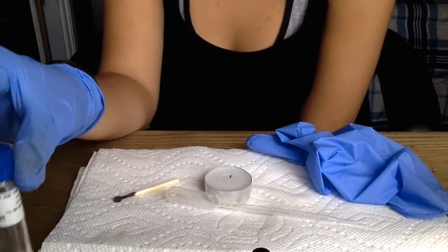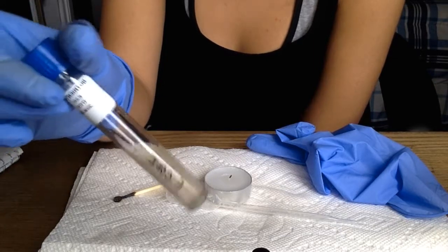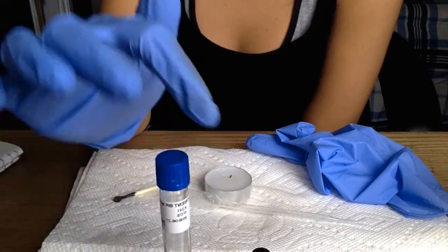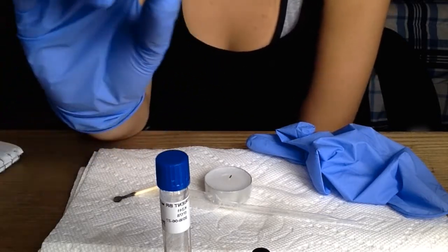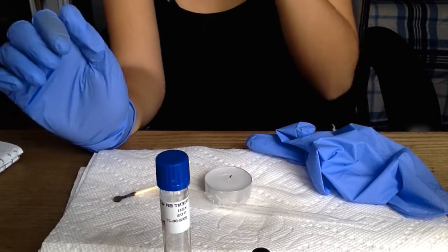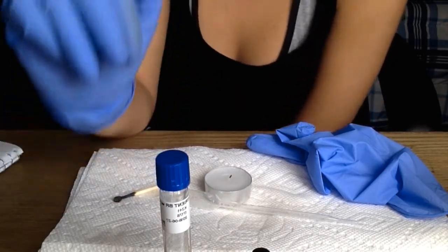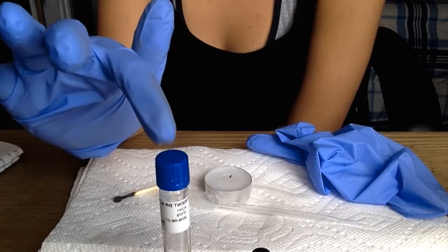Then I placed all of this solution into the nutrient broth here, which I previously already labeled E. coli. But before capping it again, I went ahead and I sterilized the lips to make sure that no other microorganisms in the air or any from my glove, that I made sure didn't touch it, but if any had touched it, we went ahead and killed it so it wouldn't interfere with the E. coli culture, which is now inside of here.